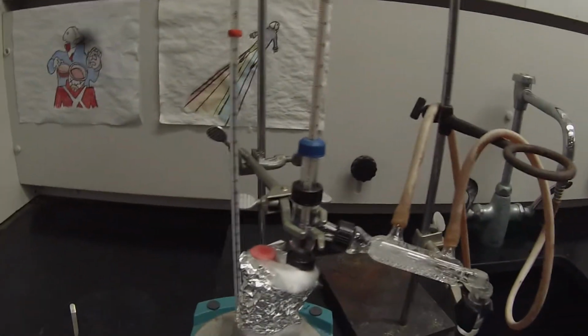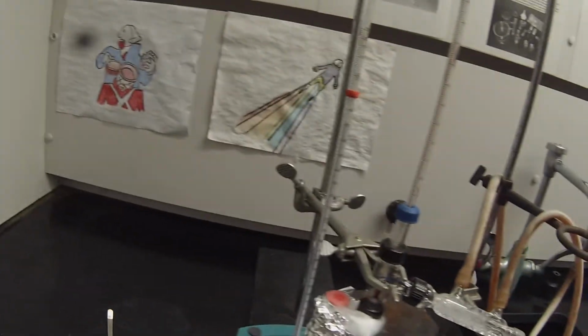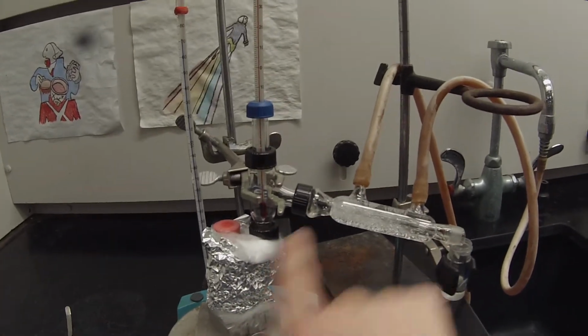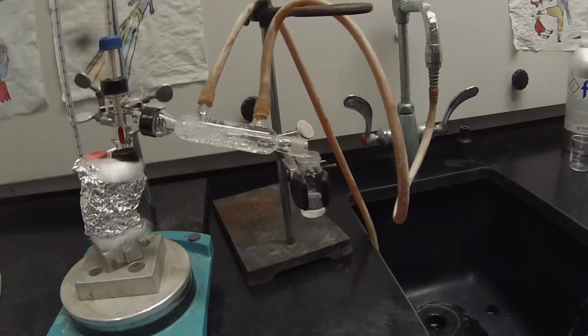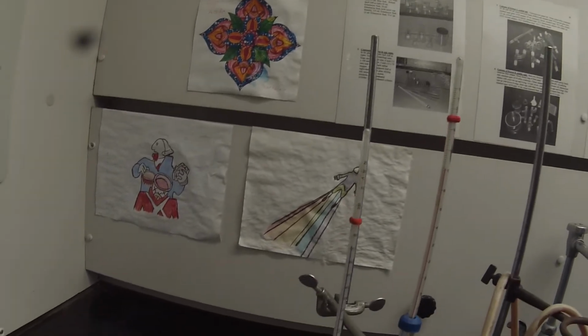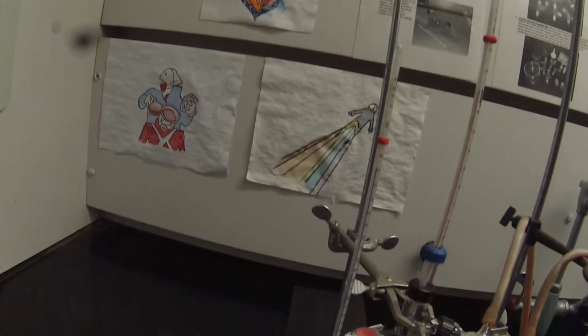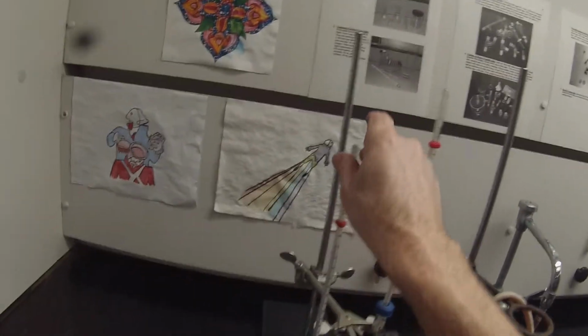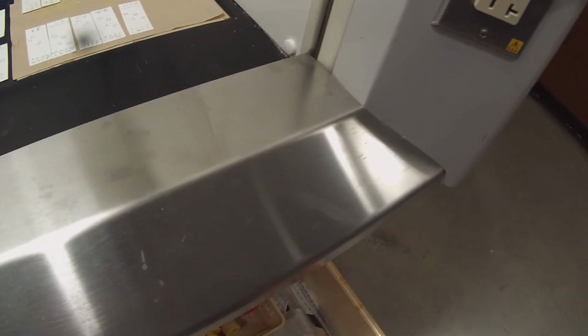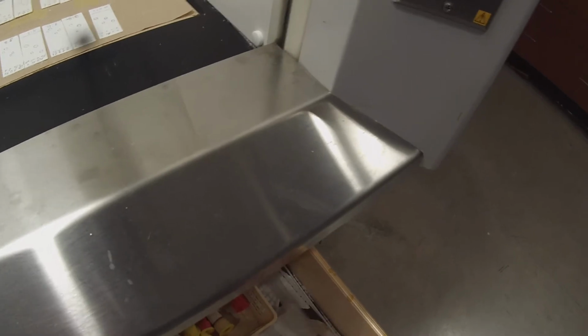Now we're going to wait until it stops dripping there and this temperature drops down, which will be our indication that we've distilled over everything that's going to distill over. Obviously there's a drip on the thermometer, there's a little bit on there, which I'll try to collect by tilting this before I disassemble it. I don't really need to know the temperature inside the block anymore. It's been 170 the whole time, up to 172. So we'll put that away so we don't break it in the disassembly process.